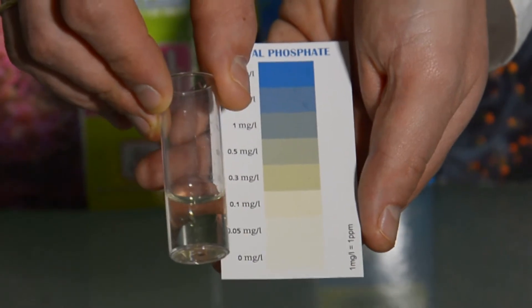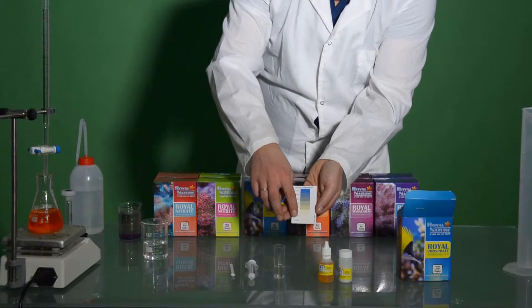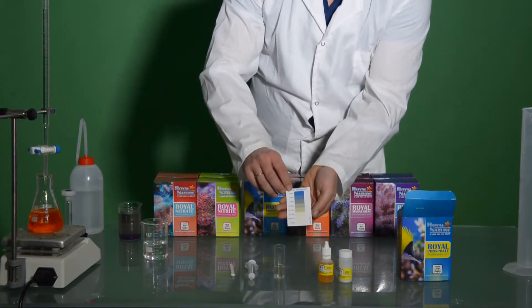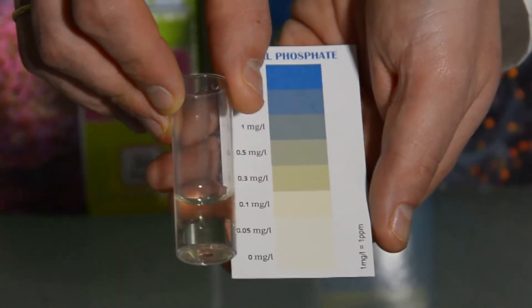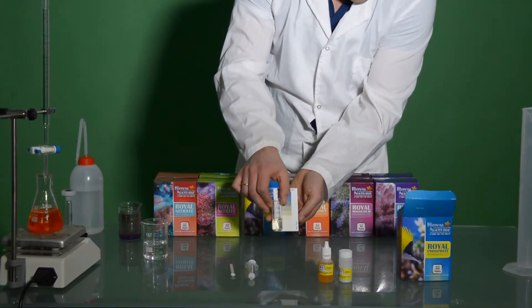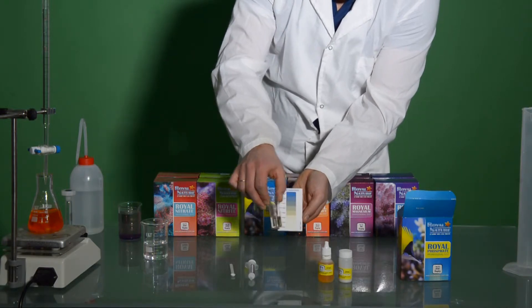An intermediate color corresponds to an intermediate phosphate content. We can see that with the fresh mix of Royal Nature Premium salt, we can see a little bit yellowish color, which corresponds to 0 ppm of phosphate in the fresh mix of Royal Nature salt.